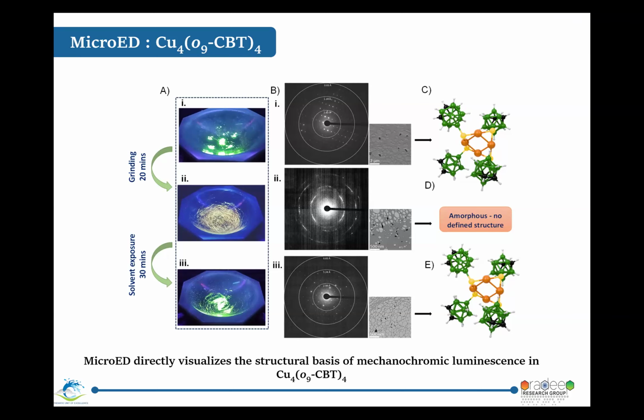Okay, thank you. Harshita, very nice talk. I'm curious about the sample preparation for your micro-ED: you are crushing the crystals, right? You are applying some mechanical force or energy. We know that clusters, or any crystal, can undergo phase transition, introduce defects in the crystal lattice, or show polymorphism under mechanical energy. When you are solving a new crystal and you don't know the structure, how do you rule out those possibilities, that there is no structural change of the cluster upon mechanical crushing? Do you need SCXRD data for confirmation, or is micro-ED alone reliable enough?